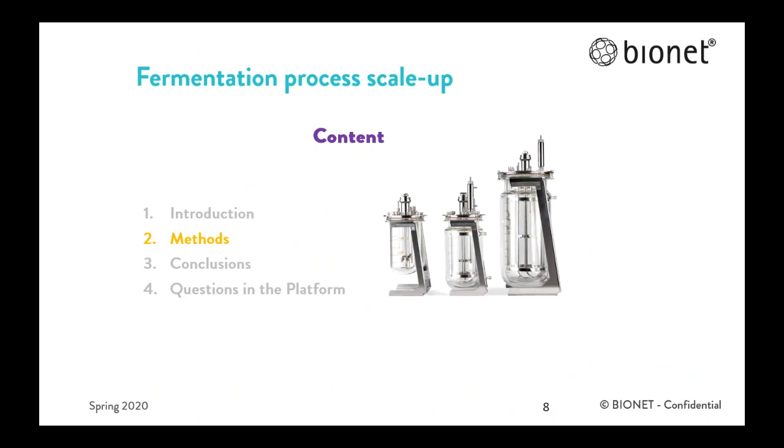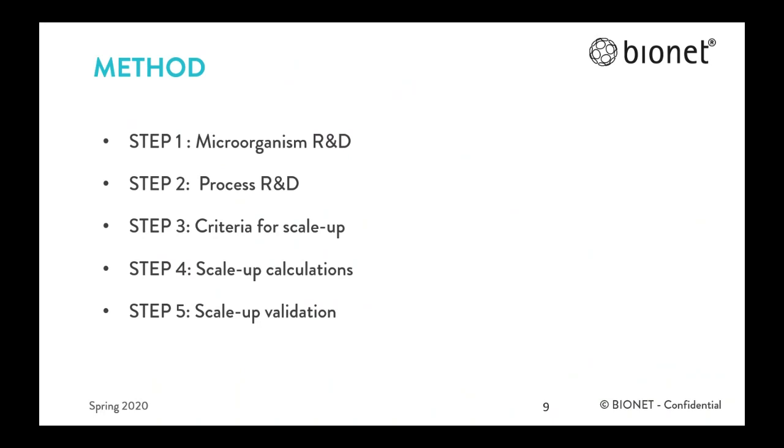After this brief introduction, we are going to start with a methodology to apply a scale-up taking into account 5 big steps. Part of the structure of these steps are basically concepts of process development. But finally, the main target of applied research and process development is to reach the commercial scale for the production of the target product successfully, minimizing risk.